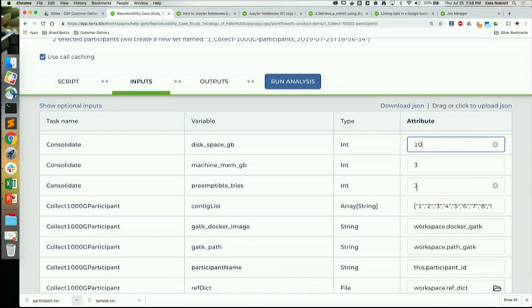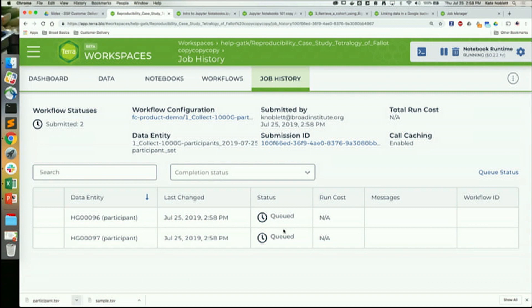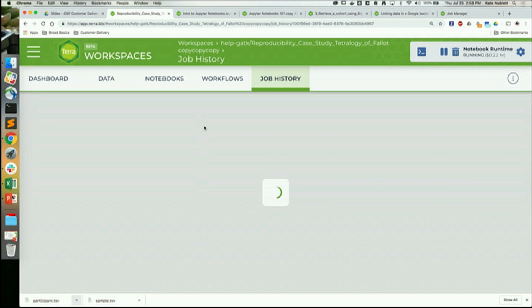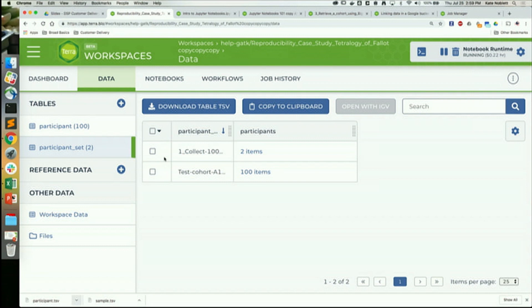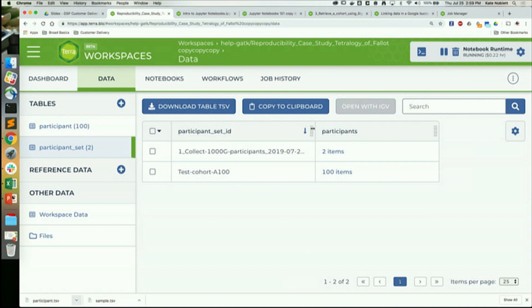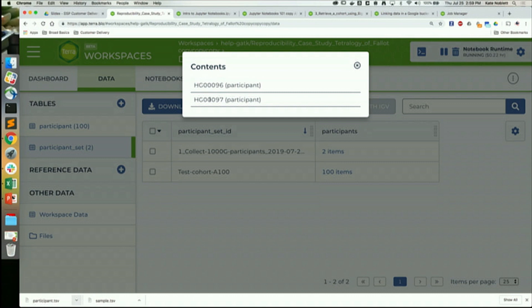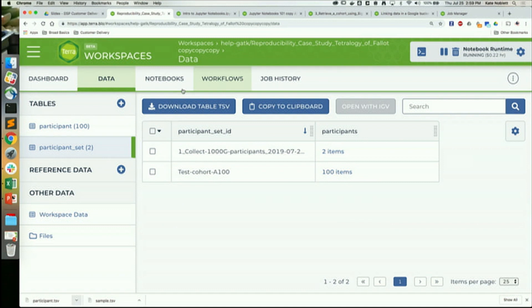I'm going to hit Run Analysis and launch. Our jobs are officially queued. If I go over to the data tab now, you'll notice there's a new participant set containing just these two items — the ones we checked. And if we want to check how our job is going, we go to the job history tab — we've changed over from queued to submitted.